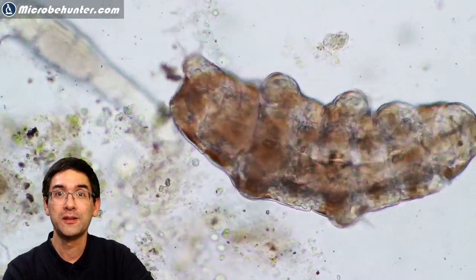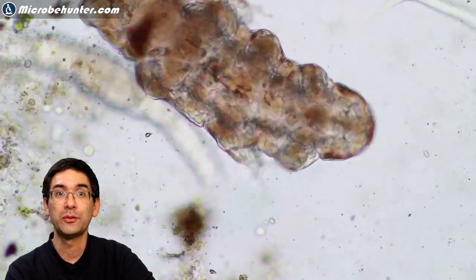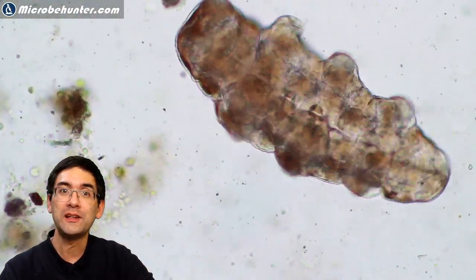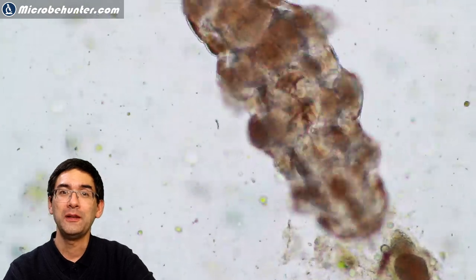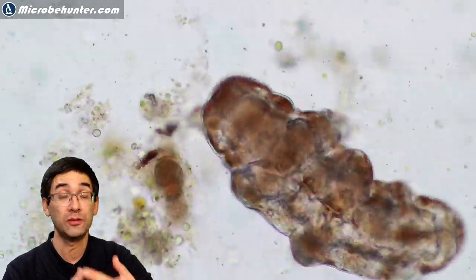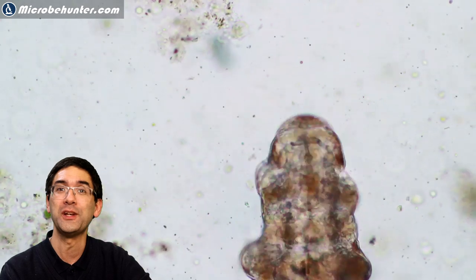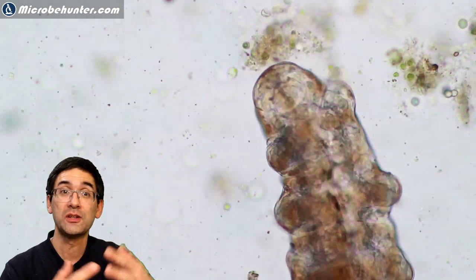Many of them are plant-eating. You can also see a rotifer crawling right next to it, and on the top right there's part of one of those worms. In any case, they are quite diverse in the food they eat. If you look carefully you can also see the mouth. Many tardigrades eat bacteria as well, which makes them very important in cleaning up the environment and decomposing material — that's why you find them on decaying wood and decaying leaves.